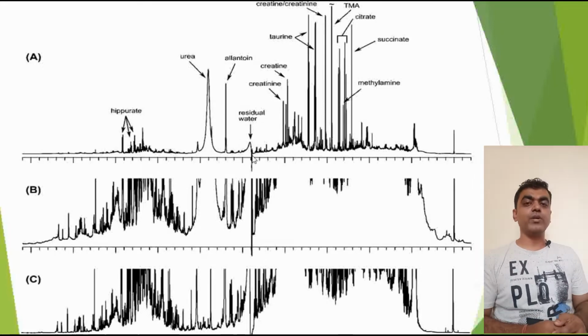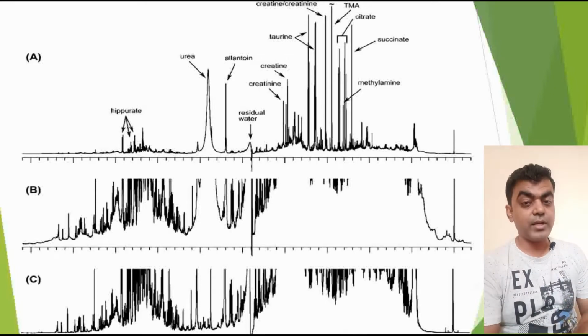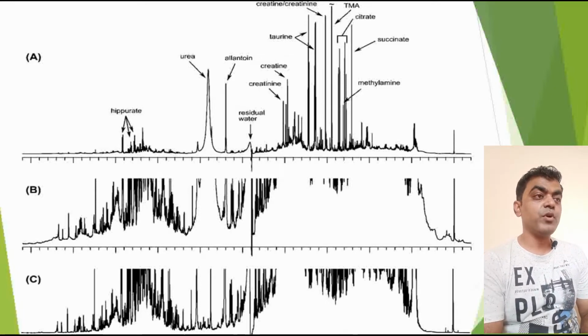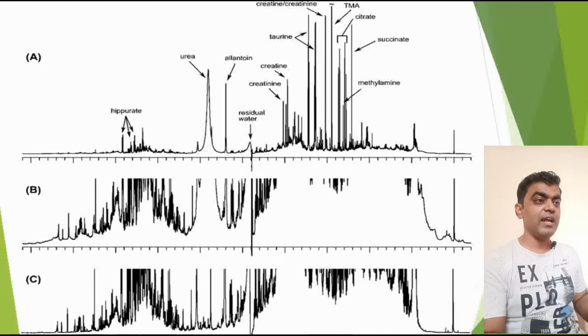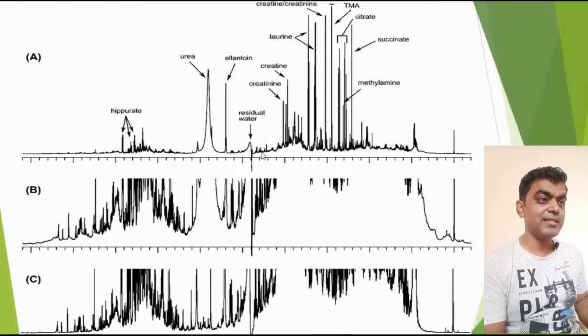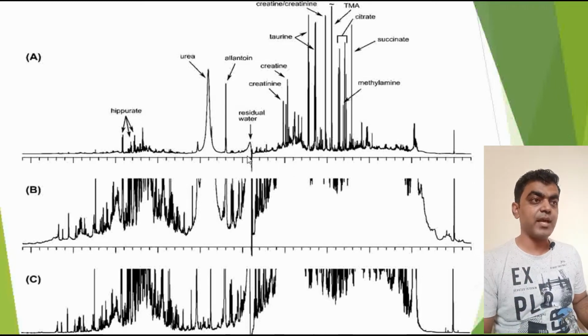So what happens when you have water? The water is full of protons, right, H2O, and these protons will give you very huge signals. So what happens is that an opposite pulse is given at the same resonance, at the same ppm position, so that the signal at this position is submerged, or subsided.